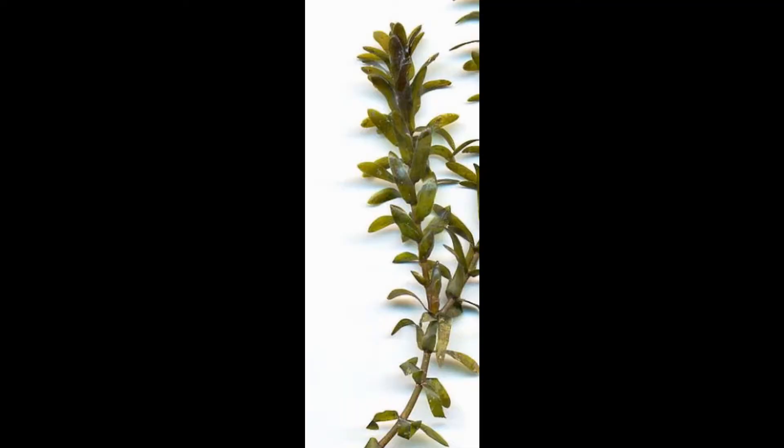Often the aquatic plant Elodea or Canadian pondweed is used. Elodea, however, is temperamental and does not produce oxygen gas reliably.